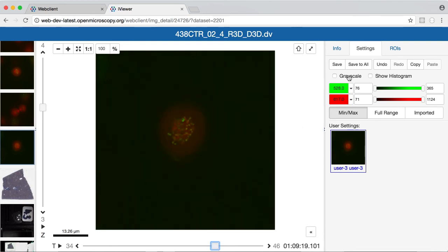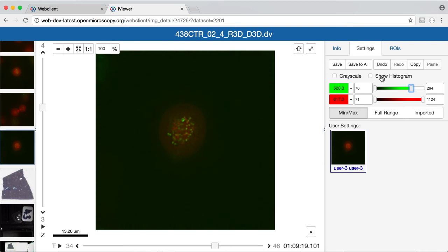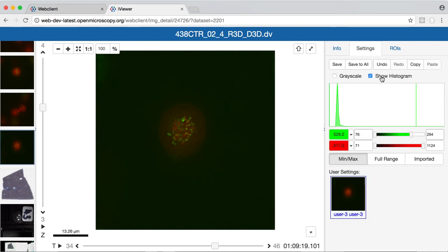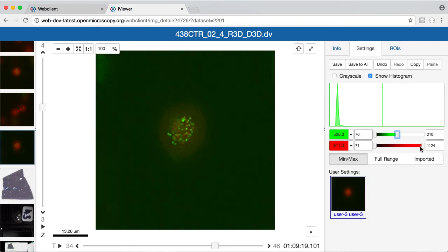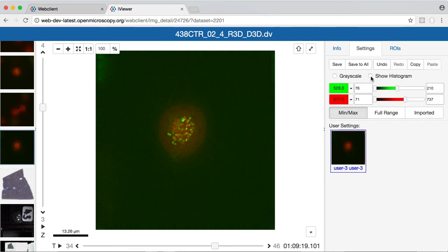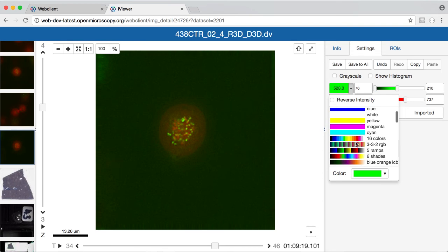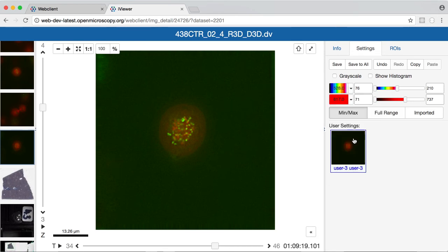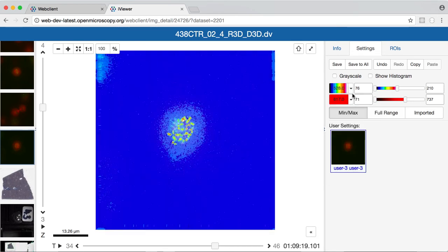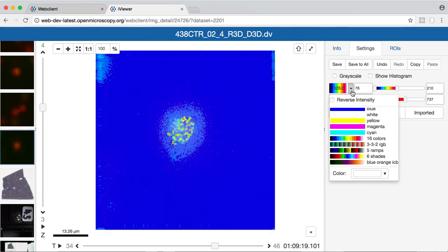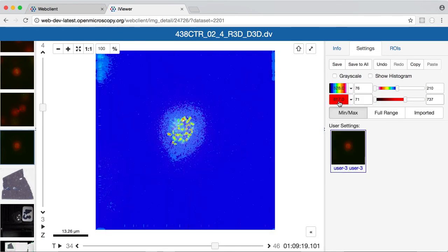The rendering panel will appear very familiar to anyone who's used our other viewers, so I can adjust the rendering settings here. We have included the newer features of histograms and additional rendering settings such as different colors, as well as lookup tables, and I can choose to reverse intensity.